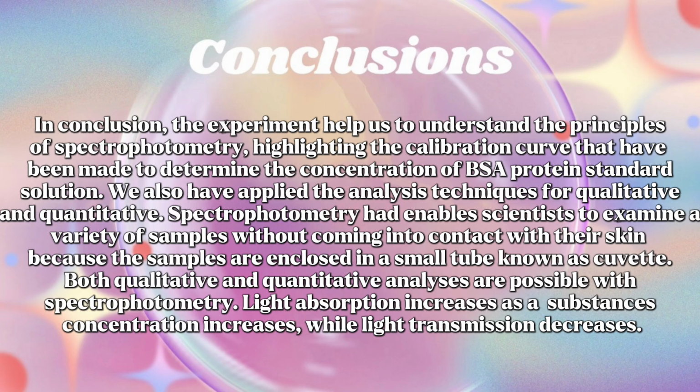Spectrophotometry has enabled scientists to examine a variety of samples without coming into contact with their skin because the samples are enclosed in a small tube known as a cuvette. Both qualitative and quantitative analysis are possible with spectrophotometry. Light absorption increases as a substance's concentration increases, while light transmission decreases.